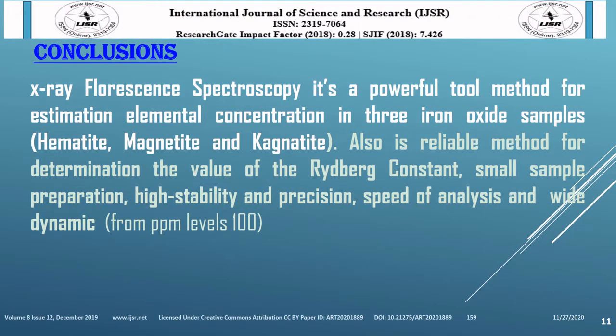Therefore, we conclude that X-ray spectroscopy is a powerful method for estimating element concentration in the three iron oxide samples. Also, it is a reliable method for the determination of the value of the R constant with small sample preparation.